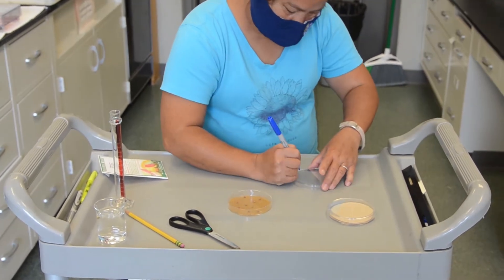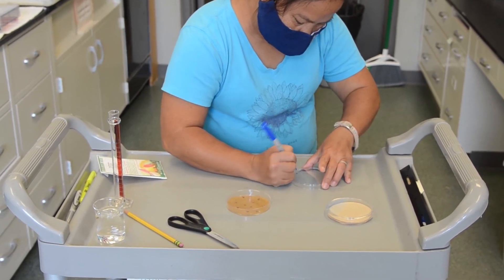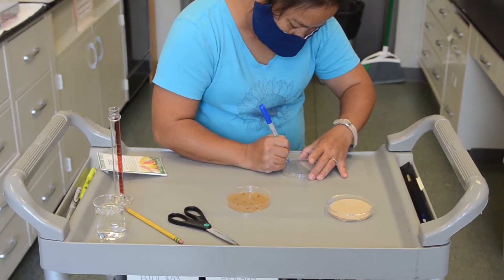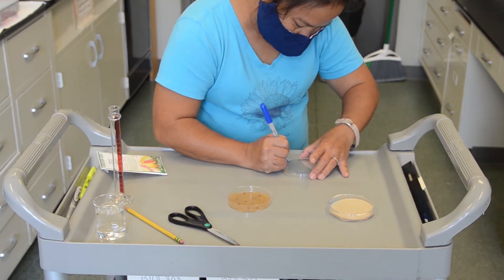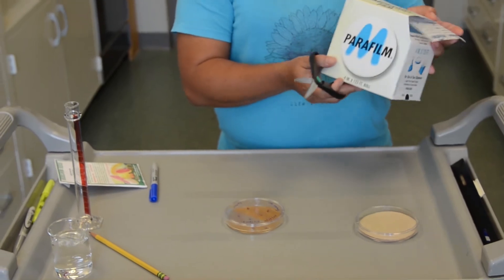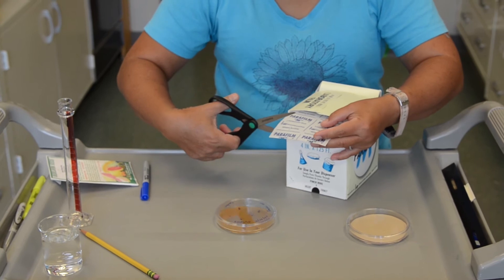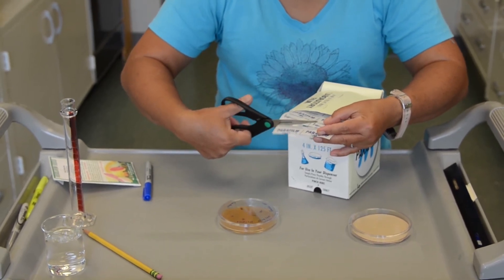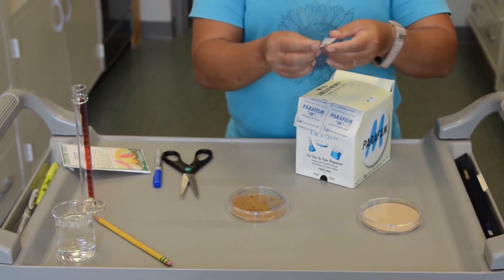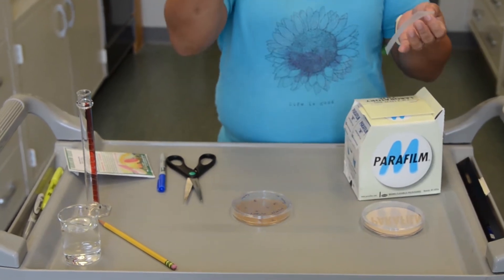Put your name, your section number — that's important — and the treatment if you have one. For example, this is my control. And then put it just like that. In our lab, we will provide you the parafilm. Parafilm is something I like to use to seal the package. So I will cut it into pieces. It doesn't have to be very thick, and you'll separate it into two parts. We don't use this part, but we will use this part, which is pretty stretchy.